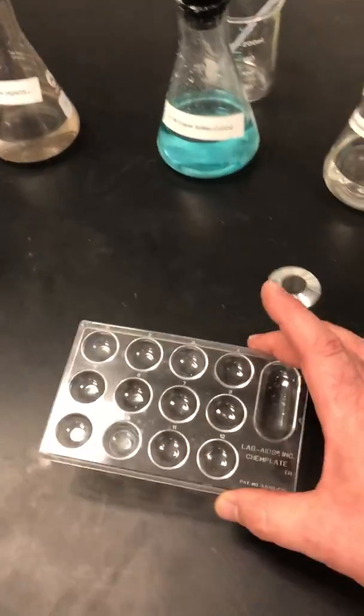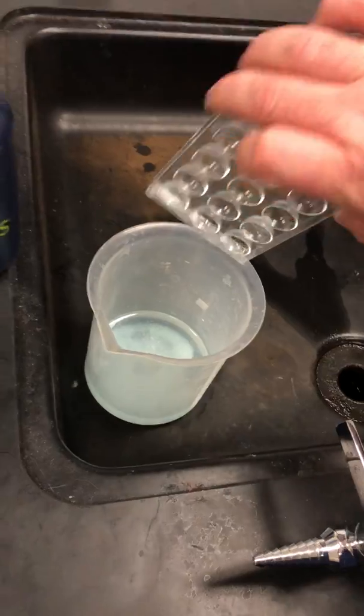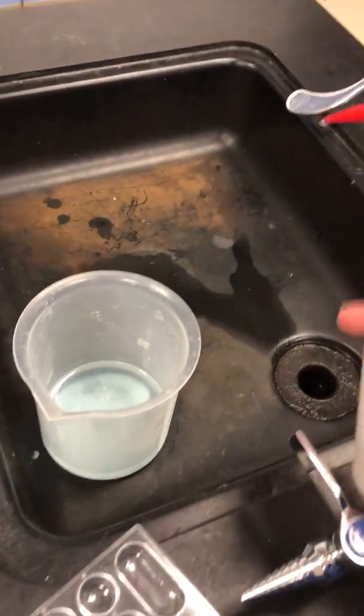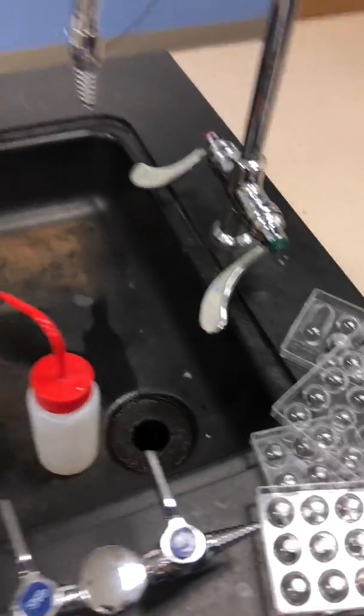Of course, when we're done, you're going to come over to the sink. You're going to dump your stuff into the waste, and then take the little rinse bottle and rinse it into there a few times, and then leave it over here somewhere upside down drying for the next group.